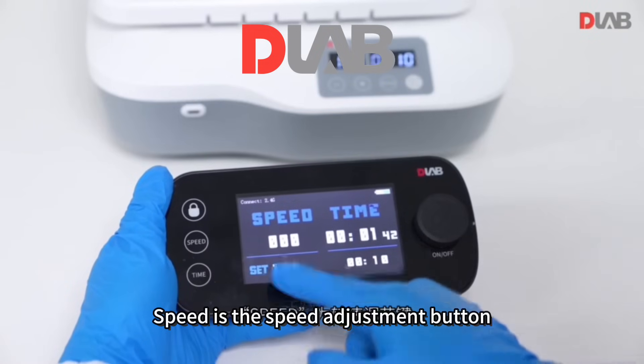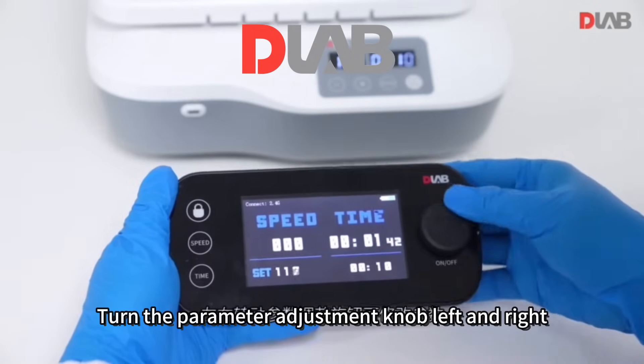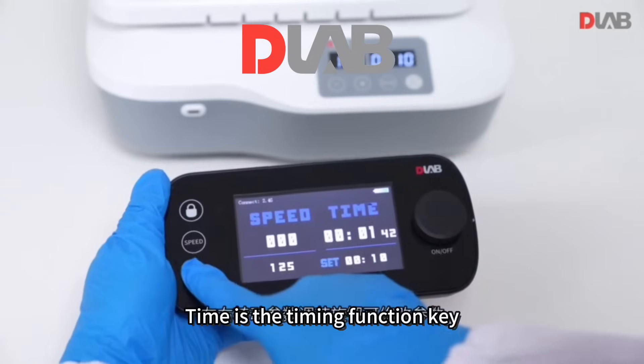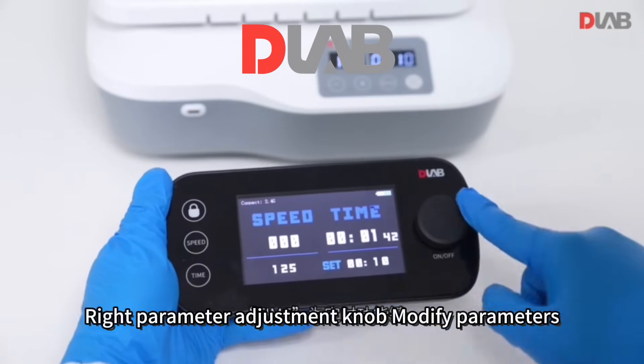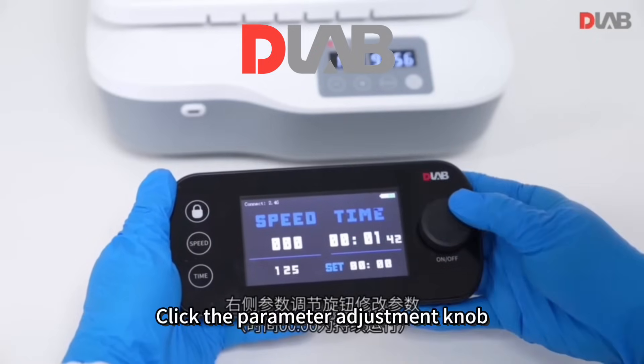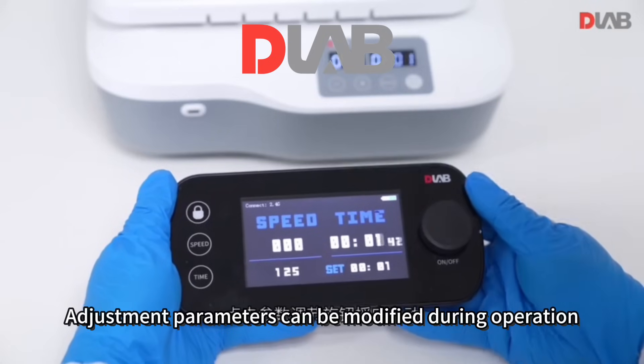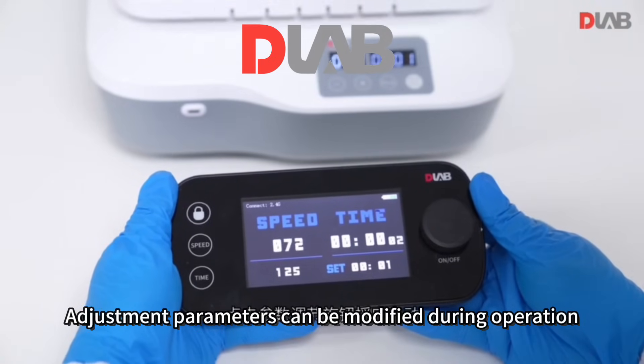The Speed button is the speed adjustment key. Turn the parameter adjustment knob left or right to modify parameters. The Time button is the timing function key; use the right parameter adjustment knob to modify timing parameters. Click the parameter adjustment knob to start the shaker. Adjustment parameters can also be modified during operation.